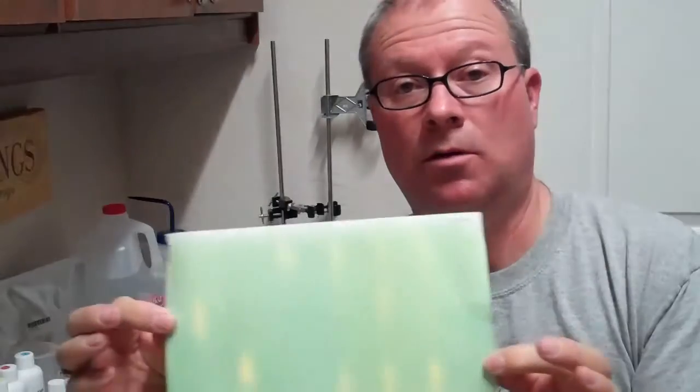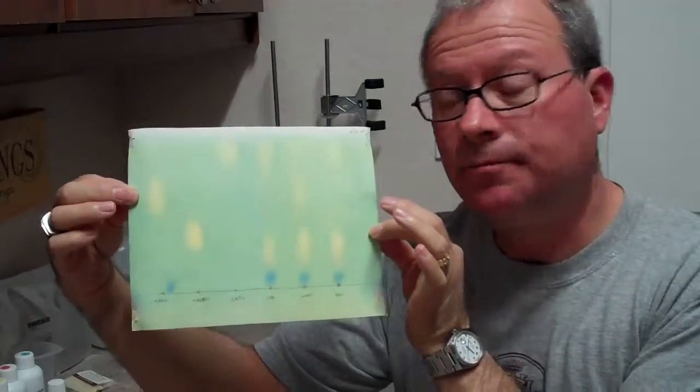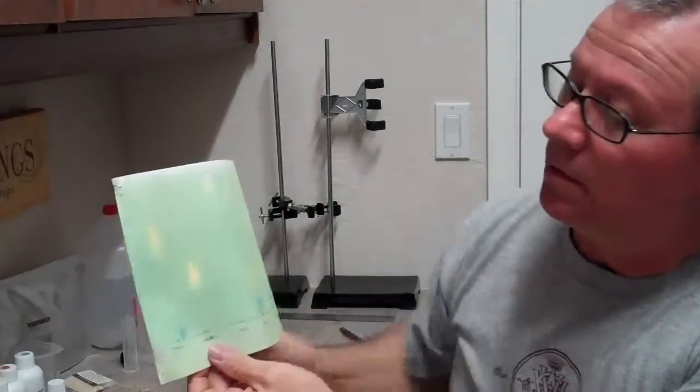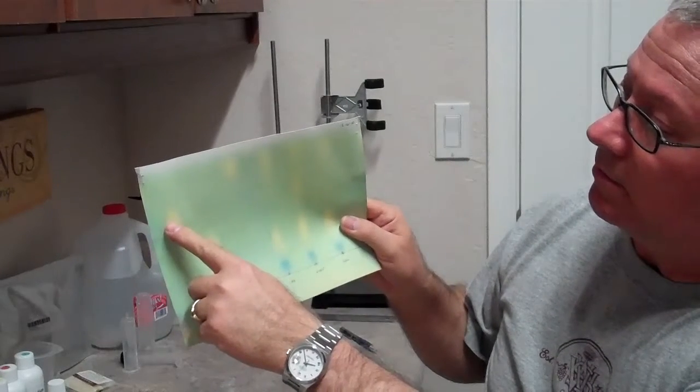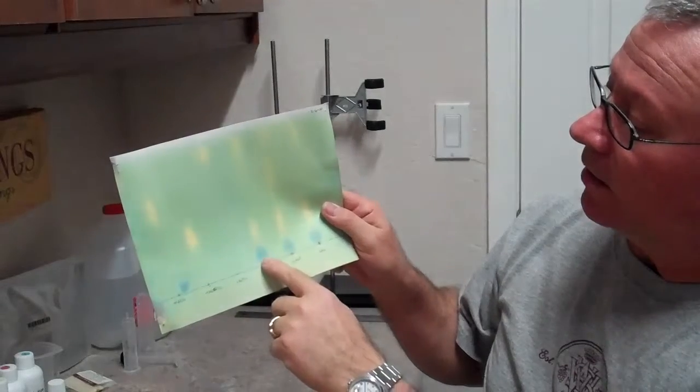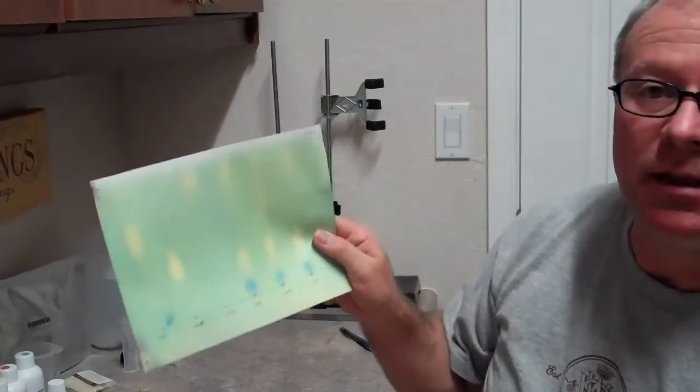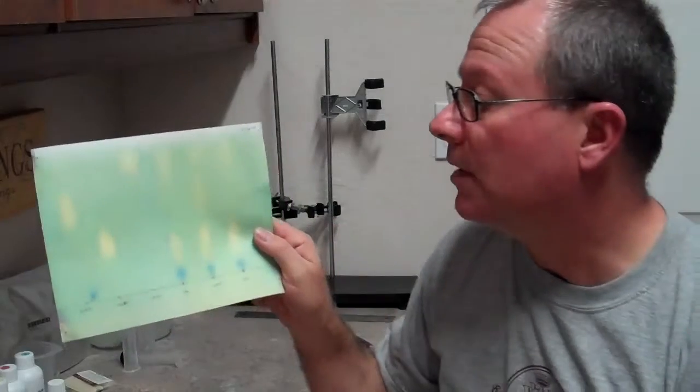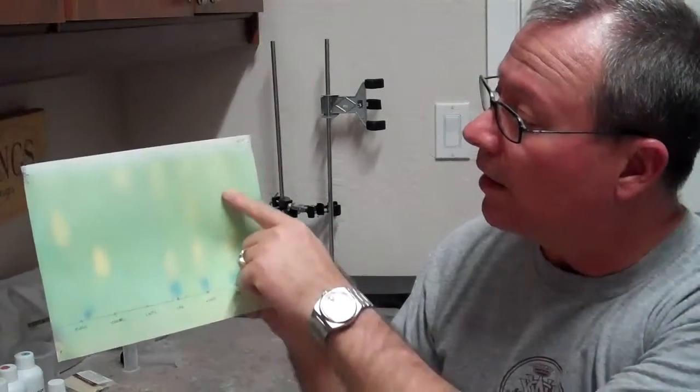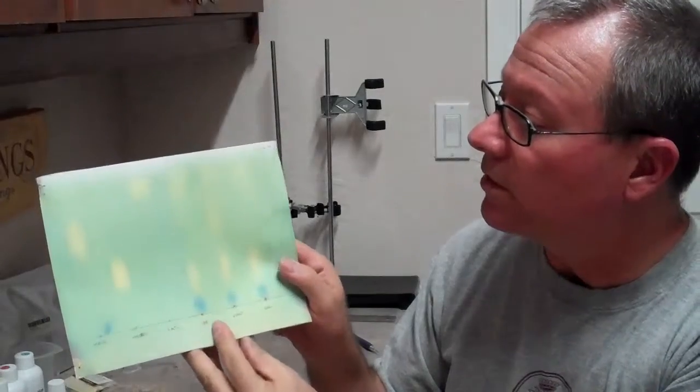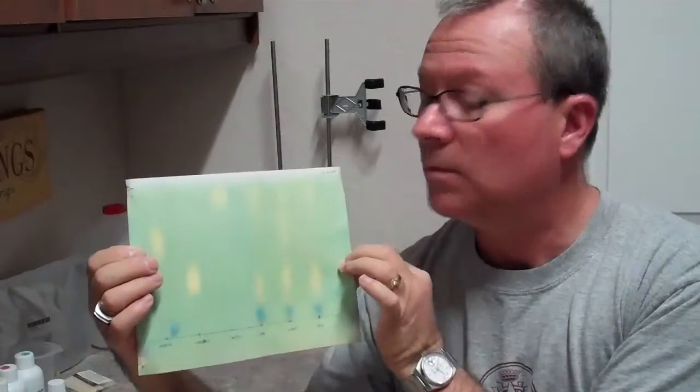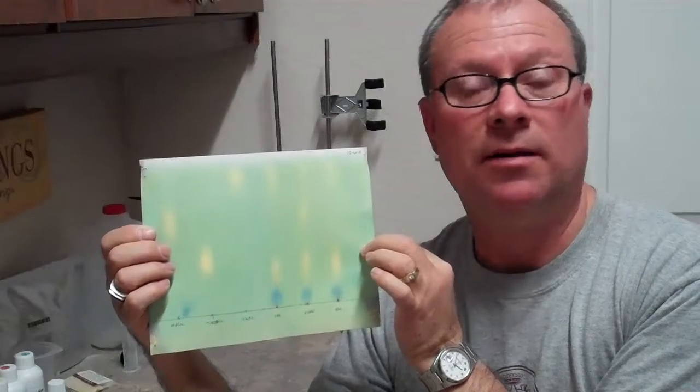We have waited 24 hours for the chromatography paper to develop, and this is what it looks like once it's done. We can see that our malic acid is at this level. This is our cab, and we can see that there's no malic acid left in the cab. We can see that there's still a slight amount of malic acid left in the Merlot, and the Barbera has completed malolactic fermentation also.